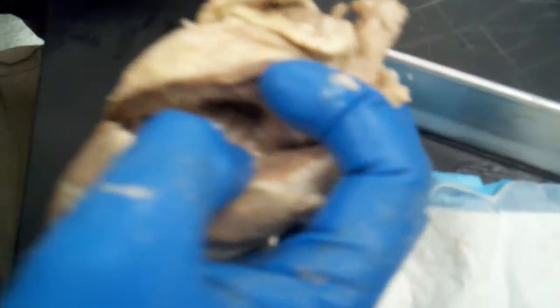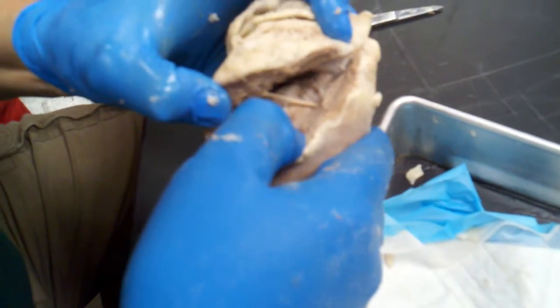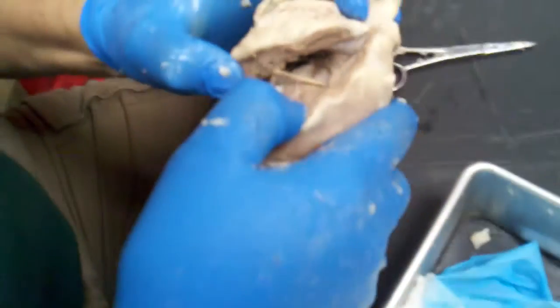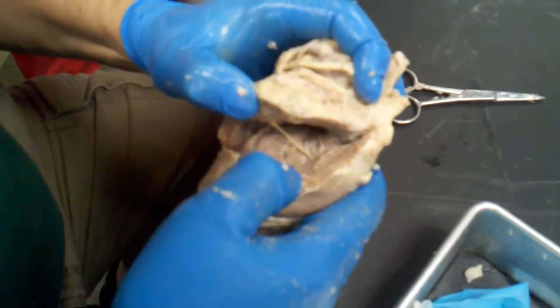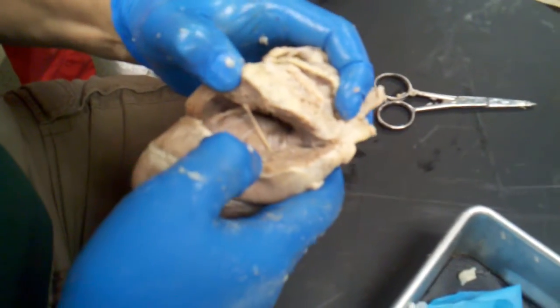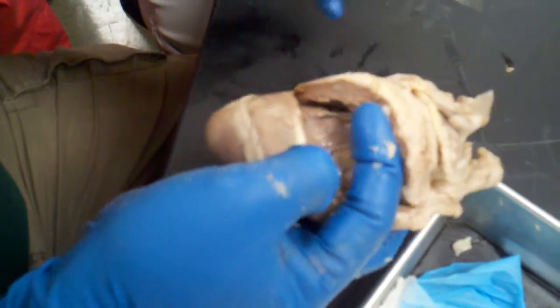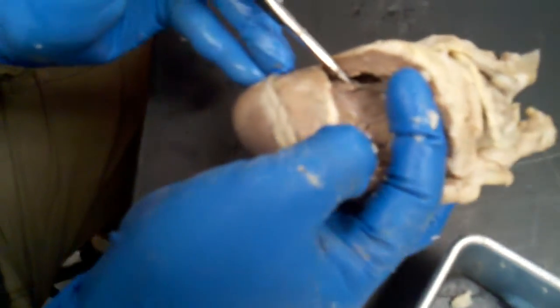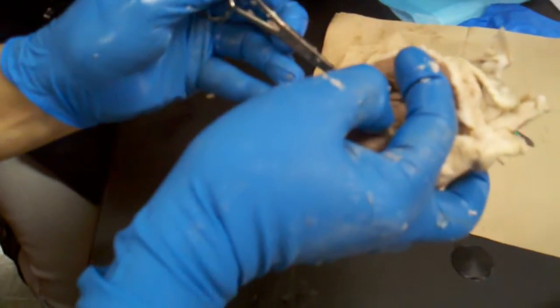Now, the papillary muscle here is very small. Okay? But you can actually see the 3 papillary muscles. The most obvious papillary muscle is this one right there. And what I'm going to do is I'm going to stand up. Those are pretty neat.